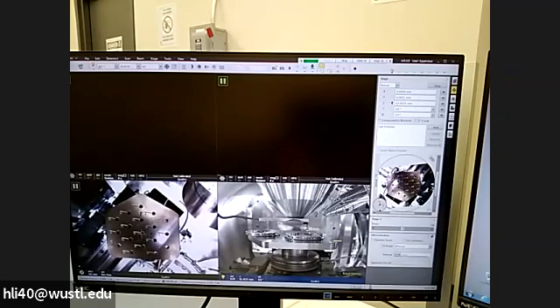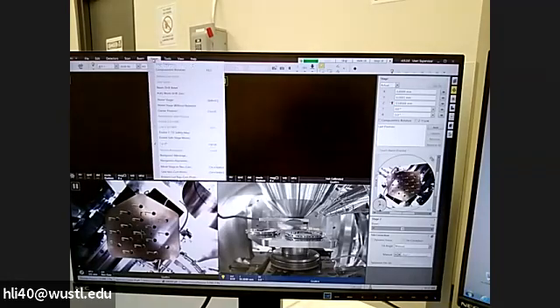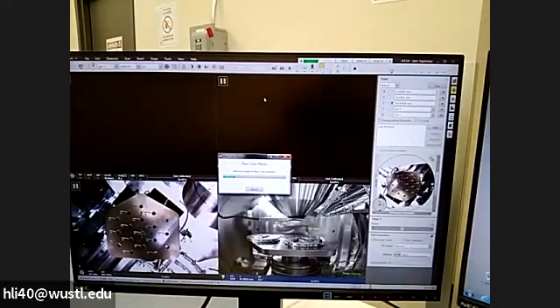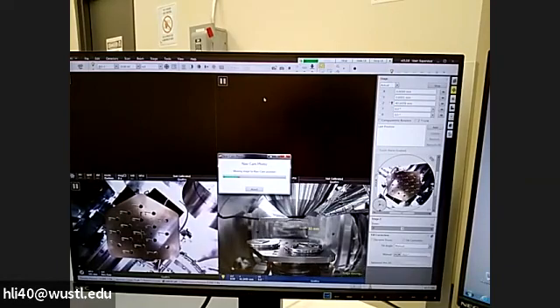So we drive the stage a little bit up to make the highest place close to the 10 millimeter line. Okay, this is acceptable already. After you move the stage close to the place, we go to the next button. You take a navigation photo, go to Stage, and click Take Nav Cam Photo. It also has a shortcut if you're familiar with them: Control Shift plus Z. Now we just click that, and it will drive to a place to take the photo.